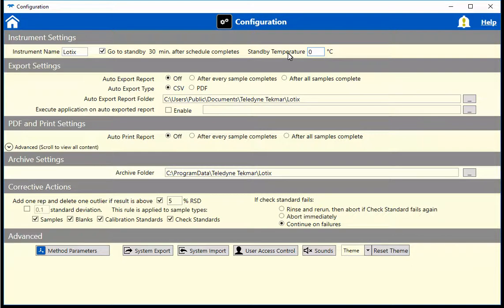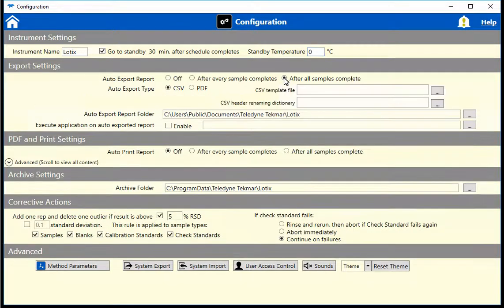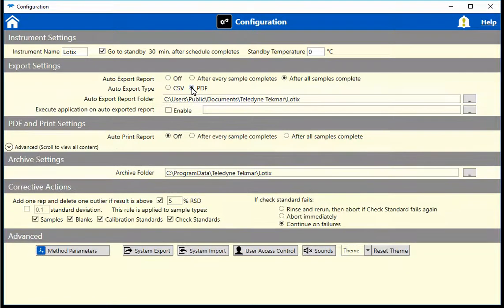To control what happens with the report, go to the Export Settings section. Choose when you want the report to export, what file type the report should be saved as, and where the report should be saved. This is also where you can export to a LIMS type system using the CSV options.